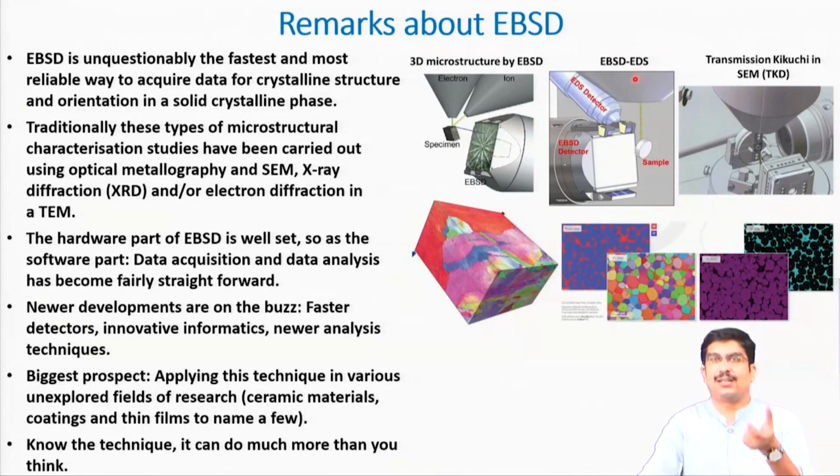Coupling EBSD and chemical analysis has fairly become very routine these days. It is nothing new. For almost the last 10 years people have been using this, and it has become very common, but it can give you a lot more than normal EBSD information.